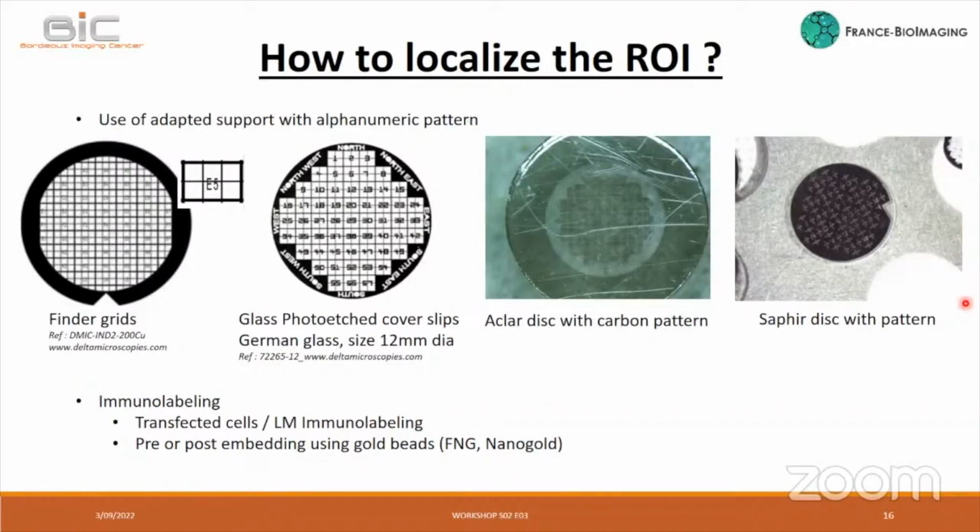But even if on paper it's a very good antibody, in reality there is a lot of controversy because it's not a robust antibody. But I won't explain more because I think during the first workshop of session 2, with the immunolabeling and ultrastructure, we will speak about fluoronanogold.